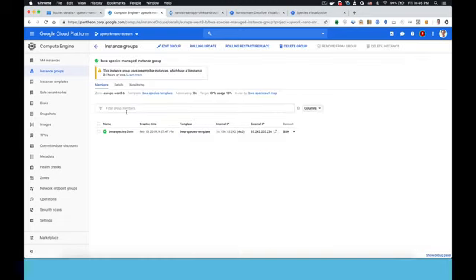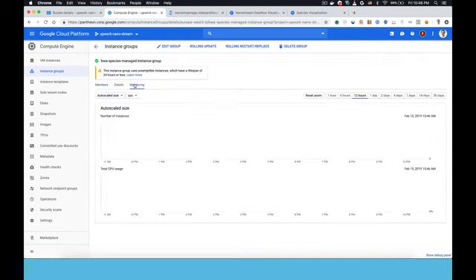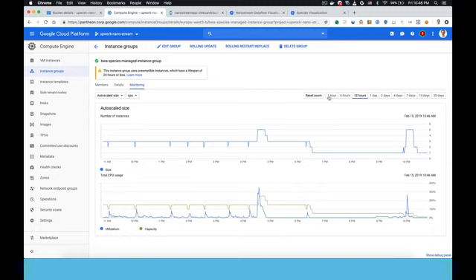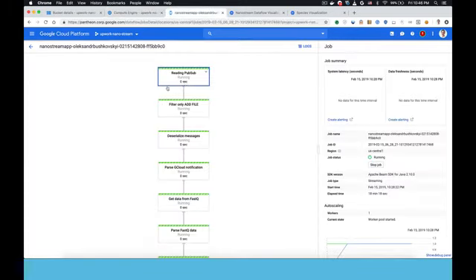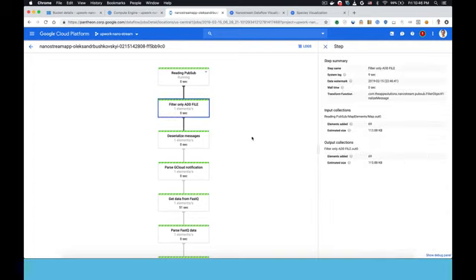Here is the aligner instance group that is actually performing the alignments. It's been running for a while, but looking at the most recent 1 hour, you can see there's a single instance running. This is what's looking up the DNA in a database to match it to a species. Now I'm showing the visualization of the Apache Beam data flow that's running. So you can see it's reading from a pub/sub queue, looking for added files, and that files are coming in, 69, 87, etc. The data are live.